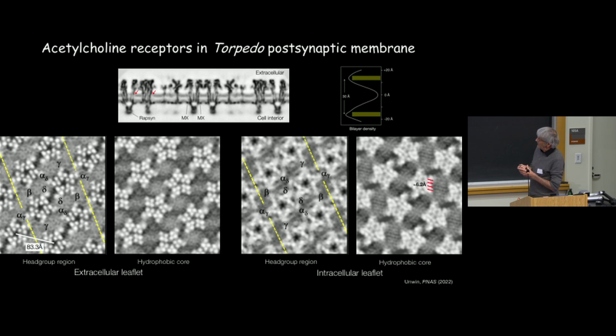Then outside that, the grey area is the phospholipid head groups. And then close to some parts of the protein surfaces, you see these black regions, the same density as the hole in the center of the channel, which must represent accumulations of cholesterol. So it binds on the subunit surfaces in specific places, and also connecting the delta subunits of neighboring receptors.